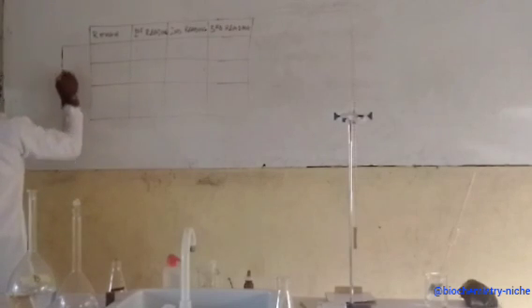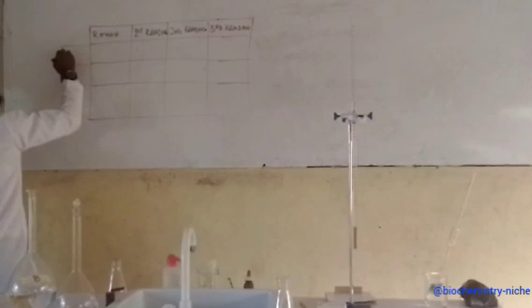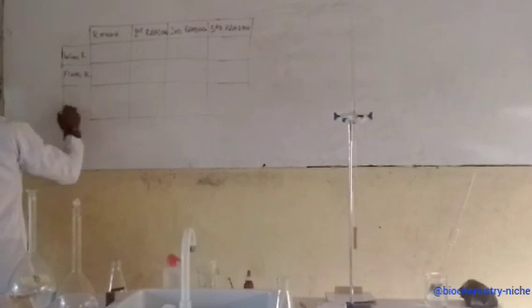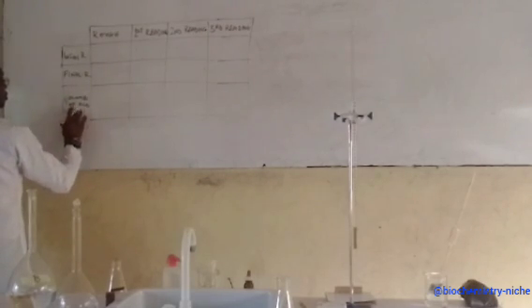So here I am having my initial reading. And here I am having my final reading, and this is going to be my volume of acid used.